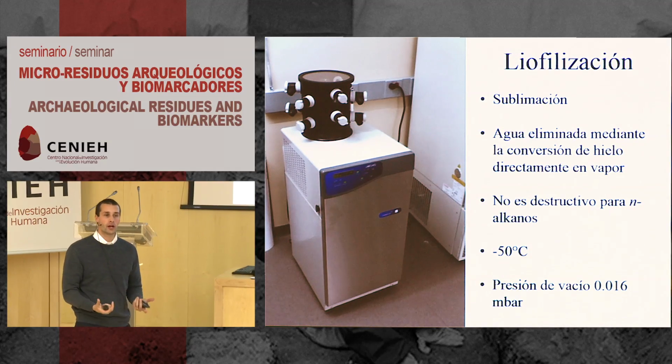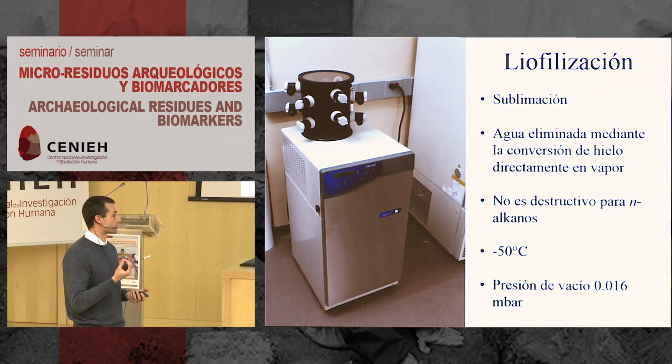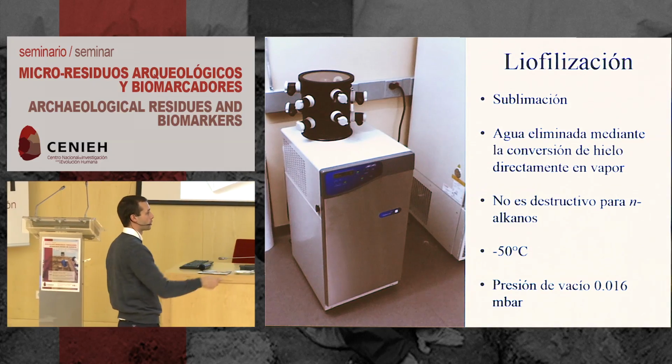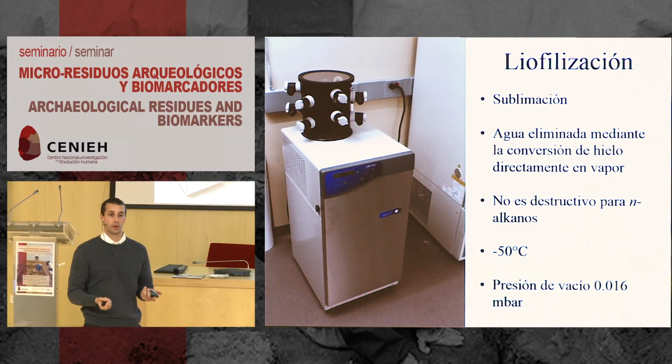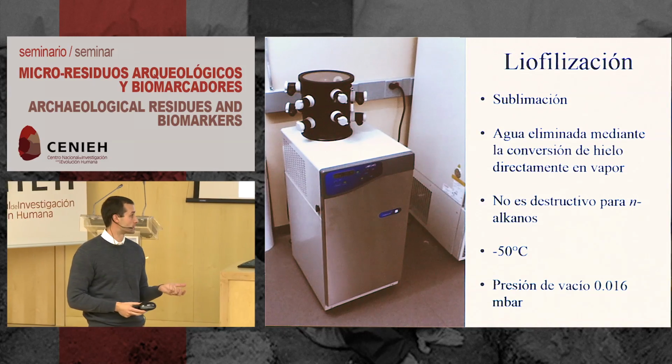But really, it drops the temperature down. So if you do have any water or any other liquid in your sample, it'll freeze it at these temperatures, and then based on these changes in pressure, it'll sublimate it right away. So this is the first step. This is really an easy technique, really minimum sample prep.